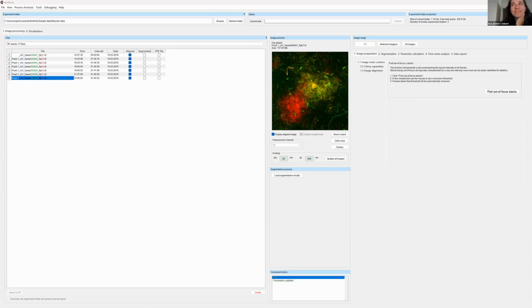Oh. But can't you download the sample data on the BiofilmQ download page, where you also download BiofilmQ? No, I don't think so. Unless it's a different sample data. Niklas, you're not unmuted. Okay, yeah. So Niklas has just sent a link into the chat, and you can download the sample data from there. I'm sorry about that.